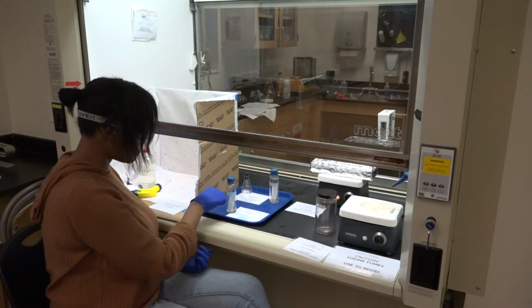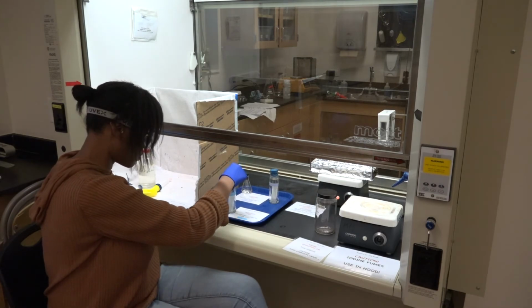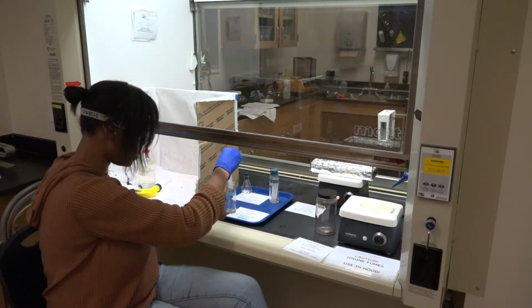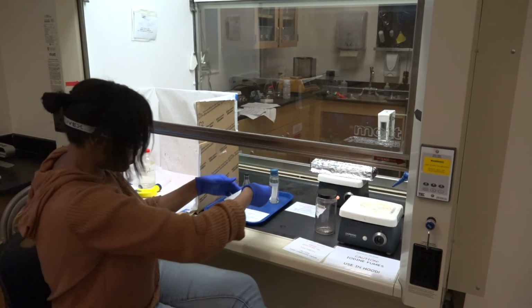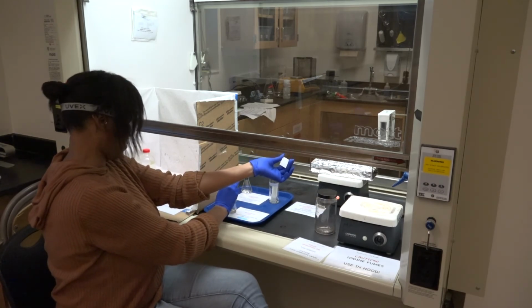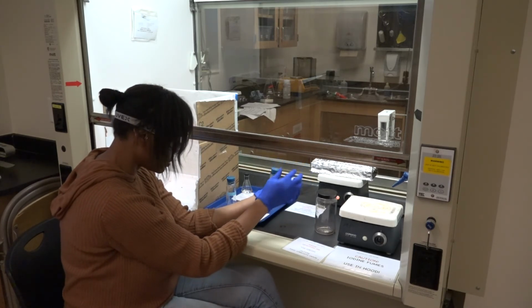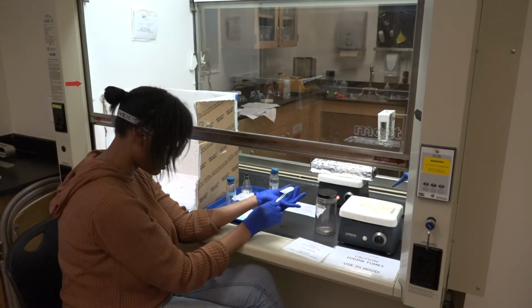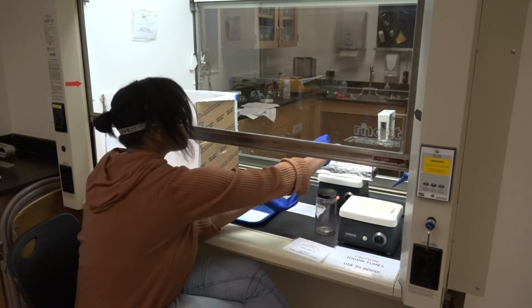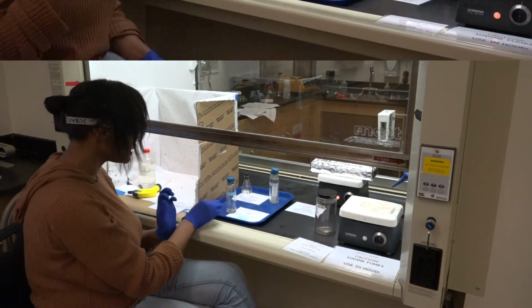Here's our amino acid chromatography strips from before, and these are ready to come out. And so I'm going to pull these out with the tweezers, and I'm going to dry them now over here on our heat rack. Okay, so we'll let those dry completely.